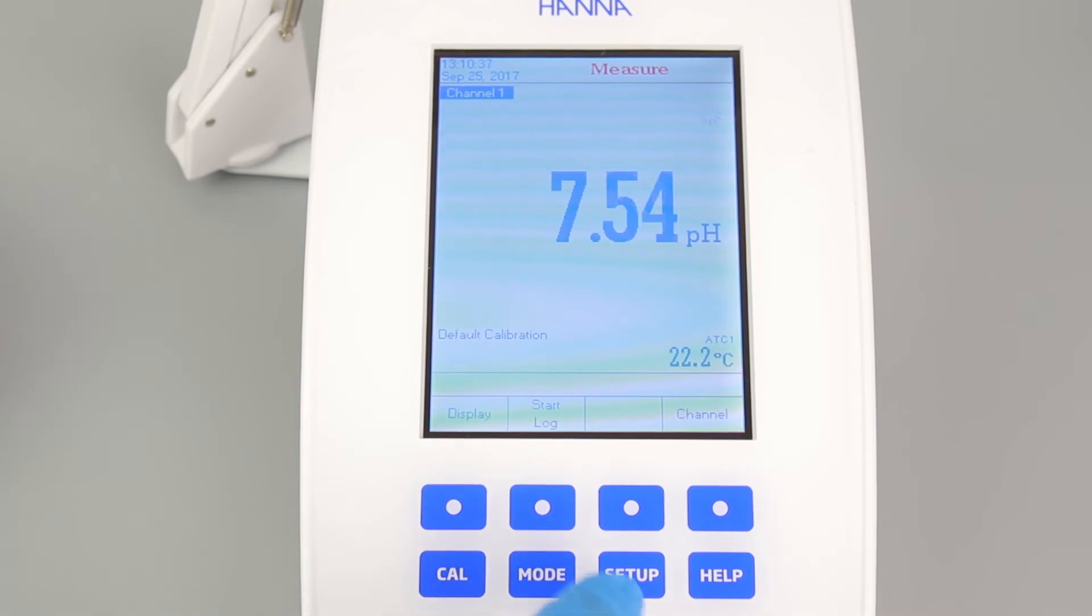Calibration is an important step to ensure your meter is operating at its best. We recommend calibrating before each use. We'll start with pH calibration.